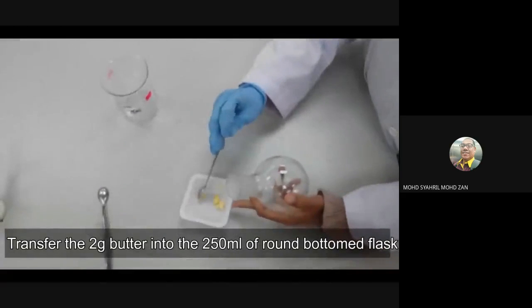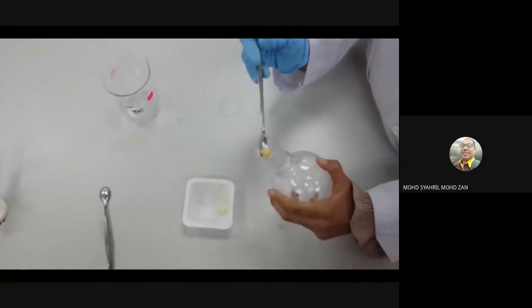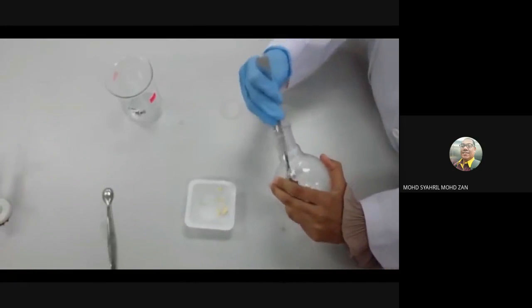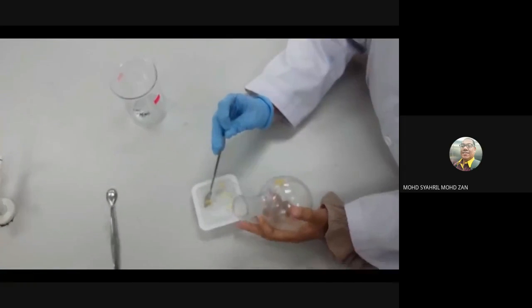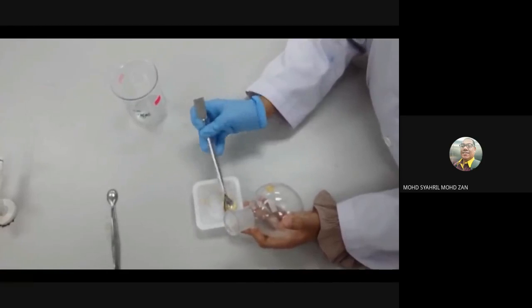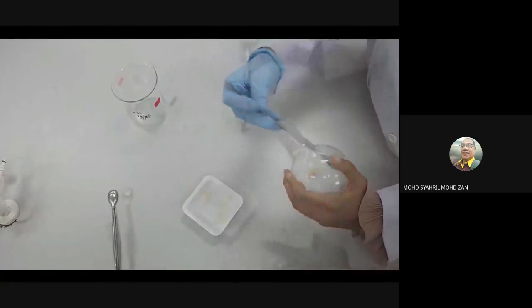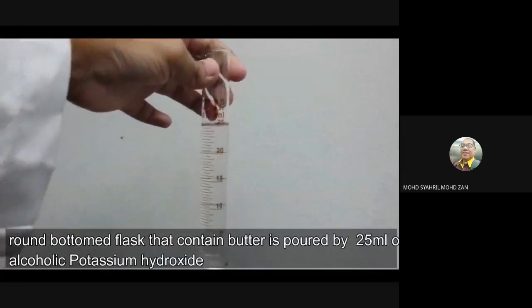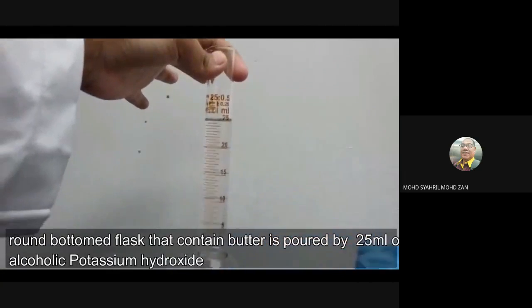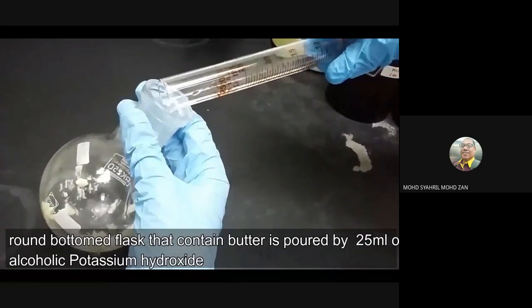Transfer 2 grams of butter into a 250 ml round bottom flask. Dissolve the 2 grams of butter with 25 ml of alcoholic potassium hydroxide.